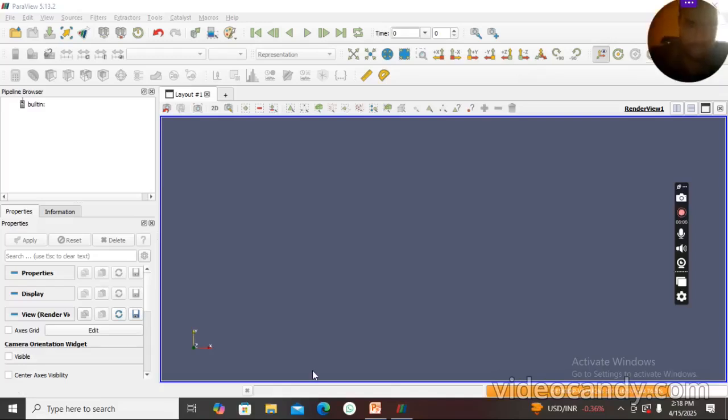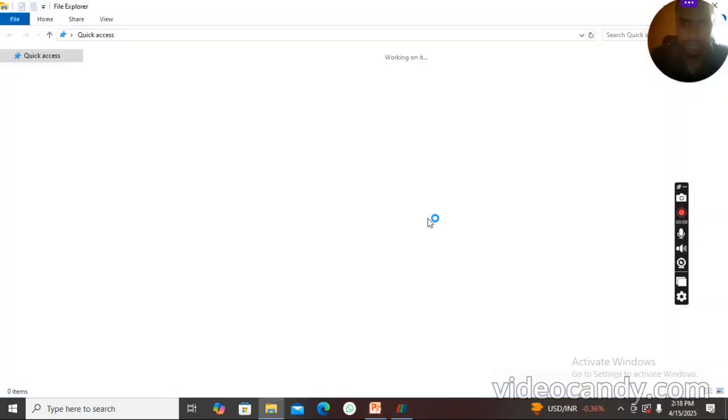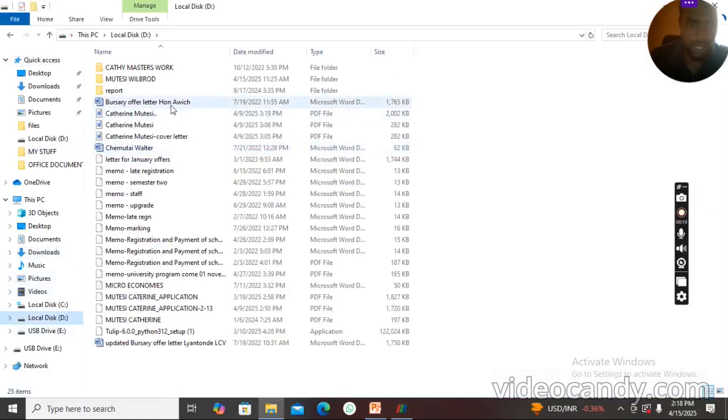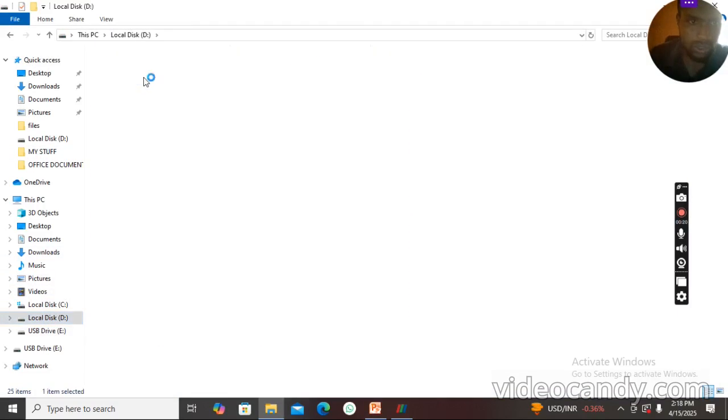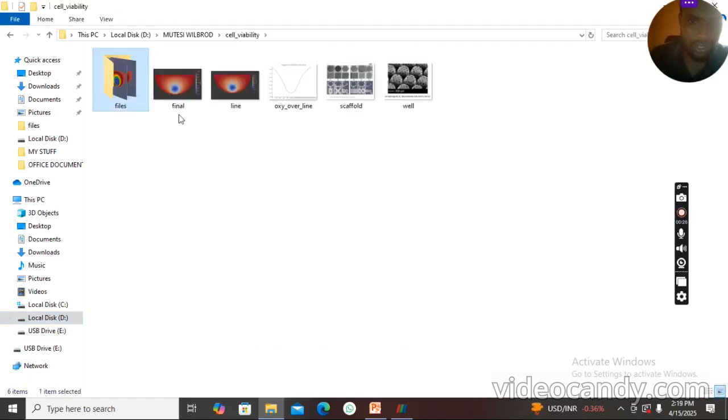Hello everyone. You're welcome to my presentation, which is 3D visualization and analysis of cell viability using ParaView. I'm going to take you through how to analyze data using ParaView, which is a tool that is used to analyze scientific data.